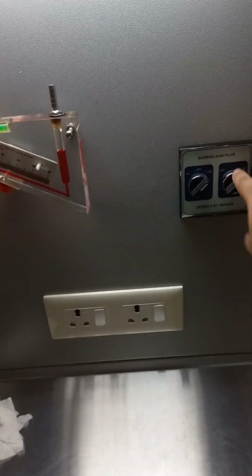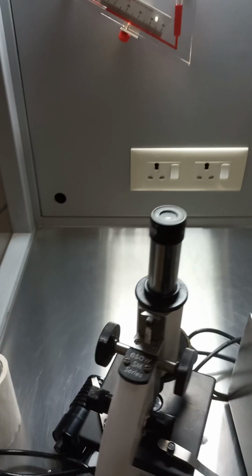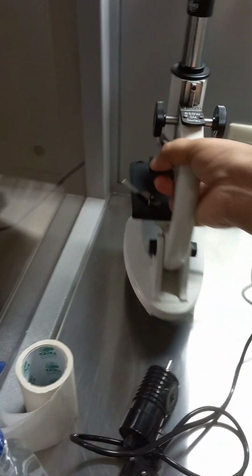So now we have our standard unit, which is over here, that you can see. Nice beautiful unit. It is made of stainless steel. As you can see over here, we have switched on the laminar flow, which is going to give us ultra pure air. And now all that we are doing is cleaning it with spirit. There would be some people who would definitely keep saying that spirit should not be used for this because it releases a lot of VOCs. However, this is a standard of doing the cleaning in our center.